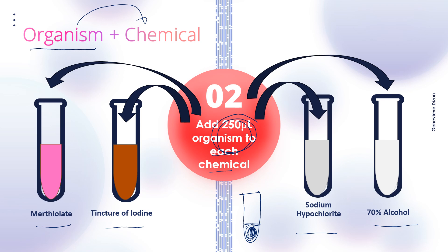While doing this, make sure that you do not let the inoculum run down the side of the test tube. After transferring, mix by gently tapping the bottom of the test tube.